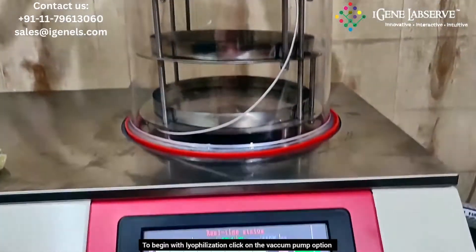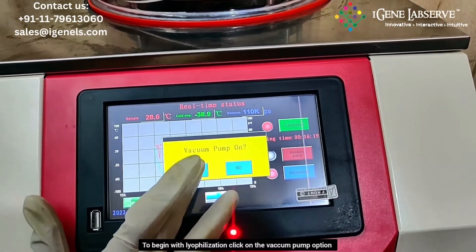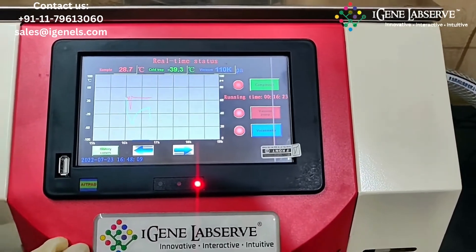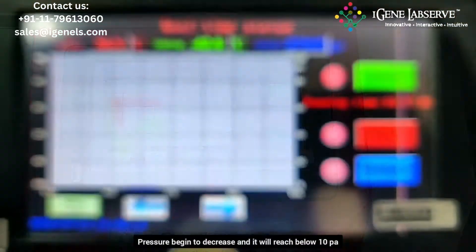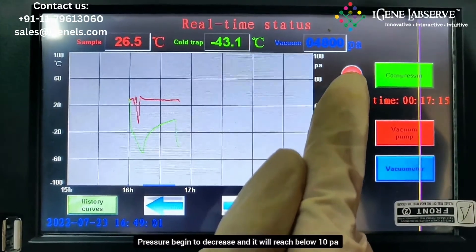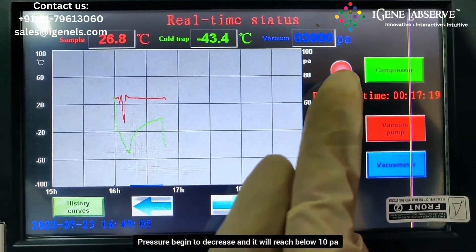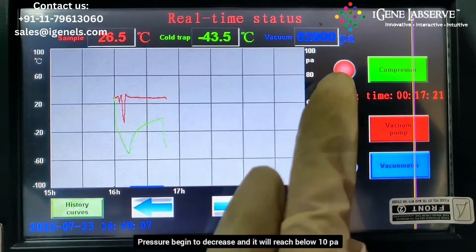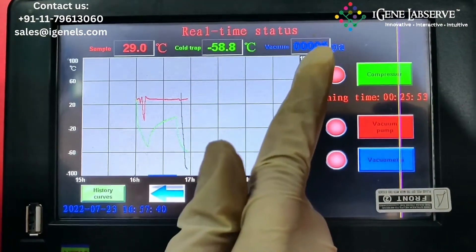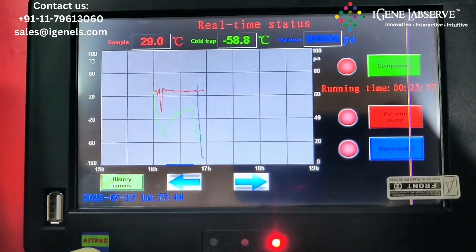Now to start the lyophilization, we have to turn on the vacuum pump. Press the vacuum pump button. Now the pressure begins to decrease and it will reach approximately 5 to 7 Pascals, and then the lyophilization begins. Now the pressure has reached 6 Pascals and the lyophilization has started.